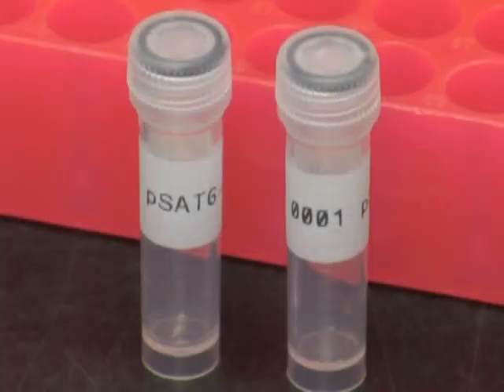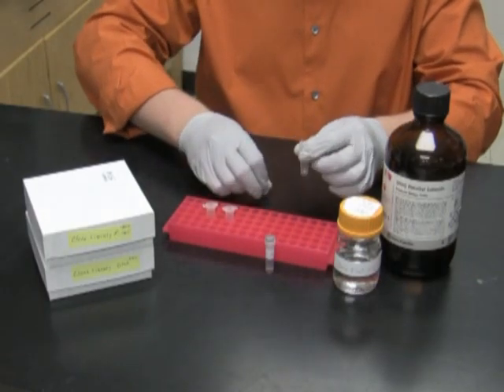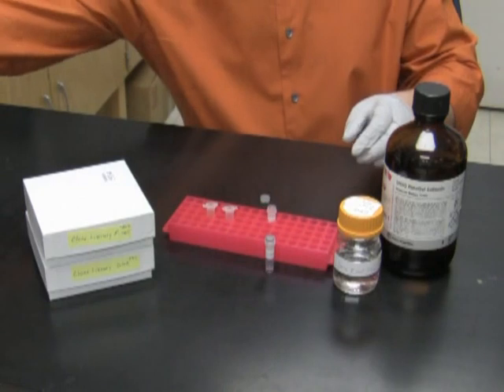For each clone I prepare two 2ml screw cap tubes with clone name and number. In one of the tubes I am going to put the DNA — all 100 microliters that I eluted from the mini prep.